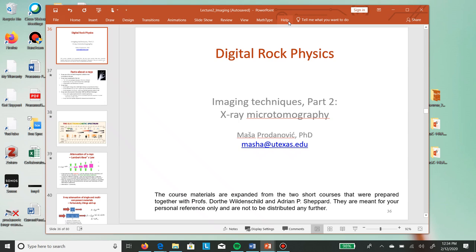Now if you inject an emulsion, that is a combination of those and has a different fluid structure, is that enough? Which phase are you going to dope? There are some of these designs where you have to actually know what is happening in the imaging device to understand how to design your experiment to see where the foam or emulsion is going, as opposed to just a single phase. So you have to understand a little bit of both: the details of what you're doing and the details of the imaging.